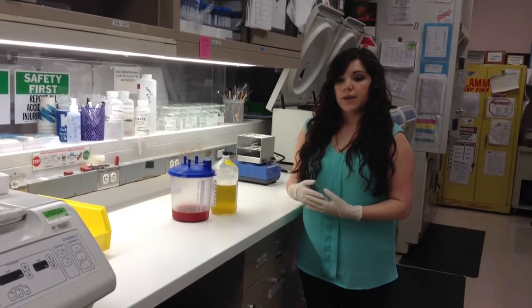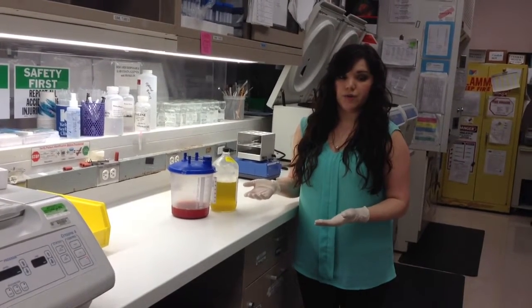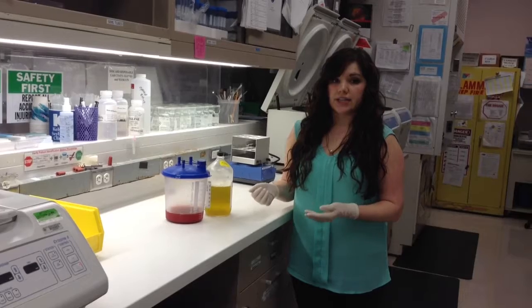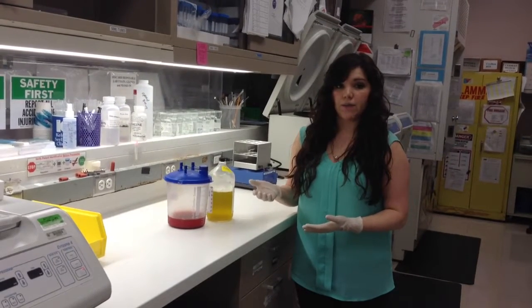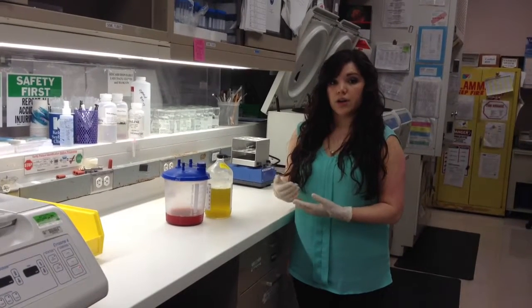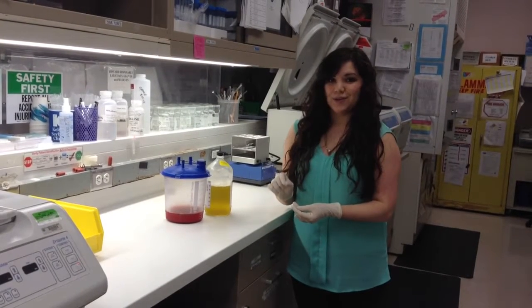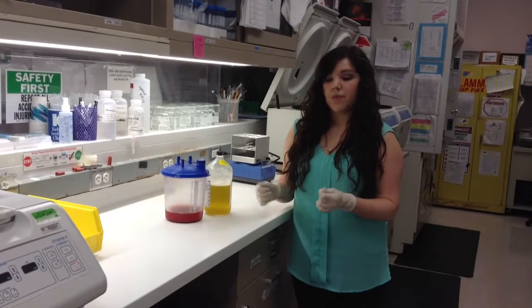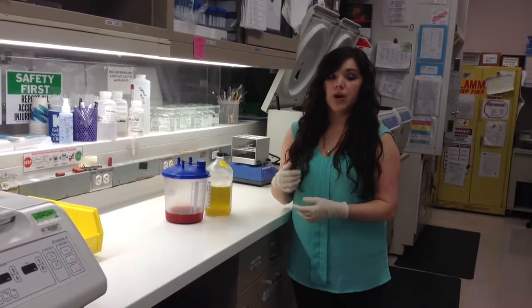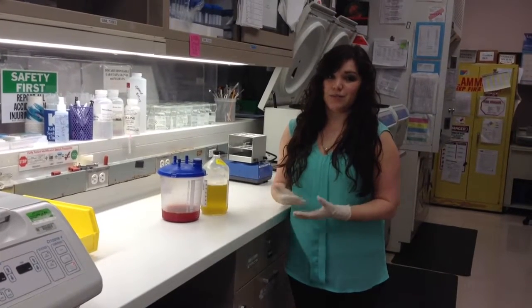And then after lunch, I recommend practicing smearing out slides with lotion. You can even give the student up to 30 or 40 minutes to really perfect their technique. Many times they do not have a smearing technique down, and so we want to maximize the time that they have with actual specimen. That's why we spend so much time teaching them with lotion. We can use some of our discarded slides, some of our spreader slides, to put just a small, delicate amount of lotion and allow them to smear. I would also take the time initially to teach them your technique and what has helped you in learning how to smear for the most efficient possible specimen to look at under the microscope.